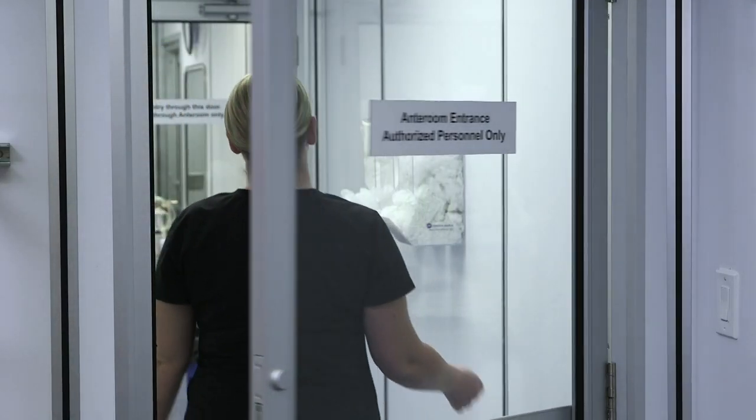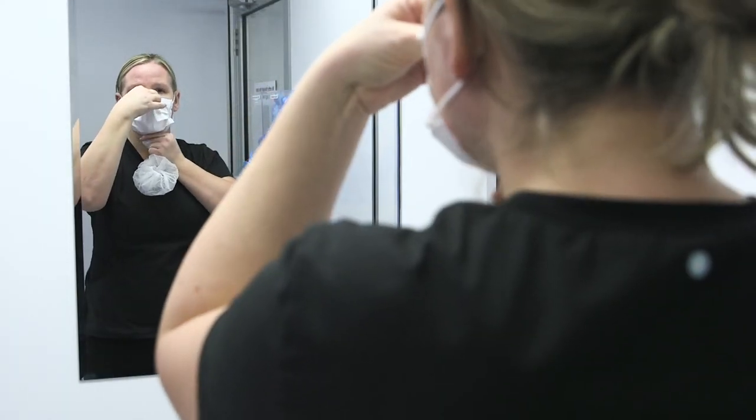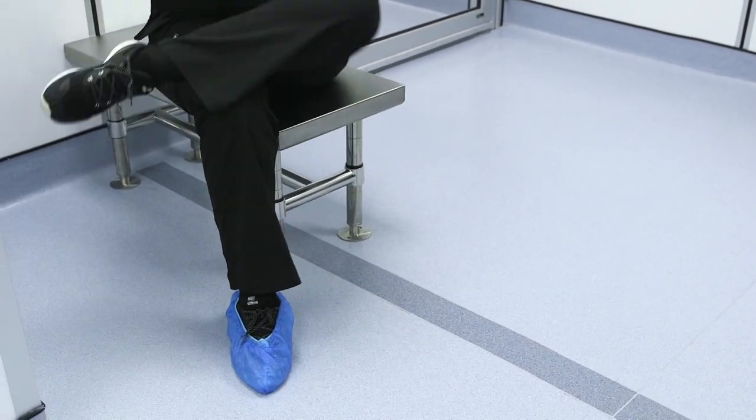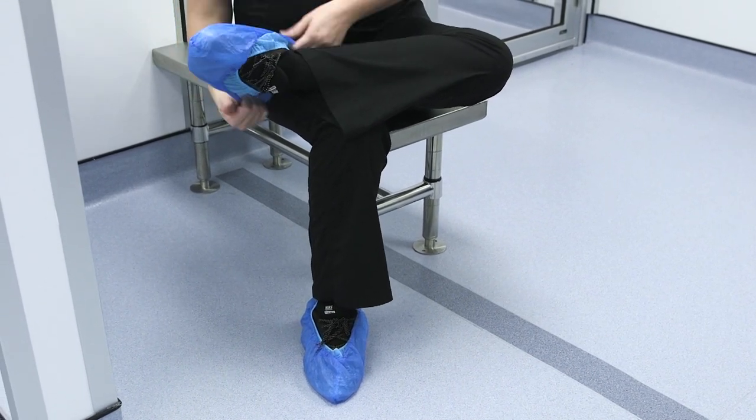Let's first review the requirements to see how they integrate into best practices for donning and doffing. When entering the anteroom, don hair, face, and beard covers if required. Next, at the line of demarcation, Chapter 800 requires workers to don two pairs of shoe covers on each foot.